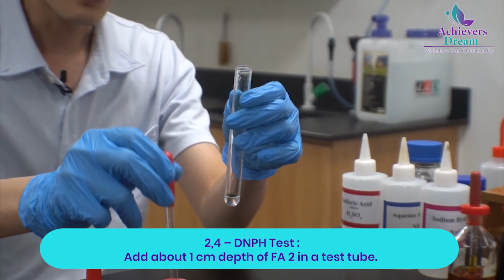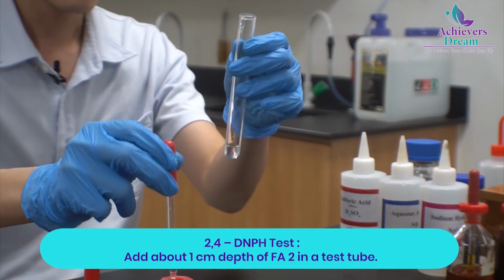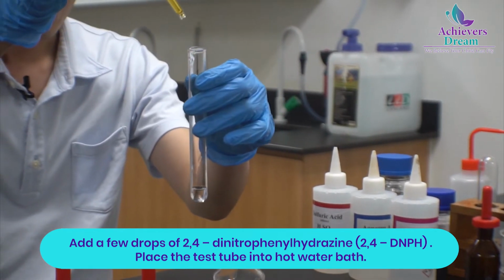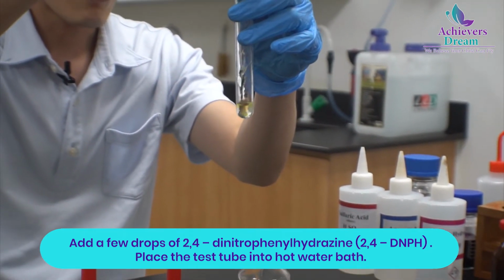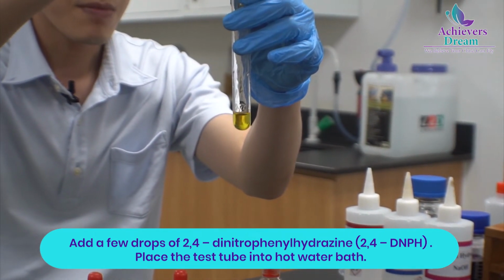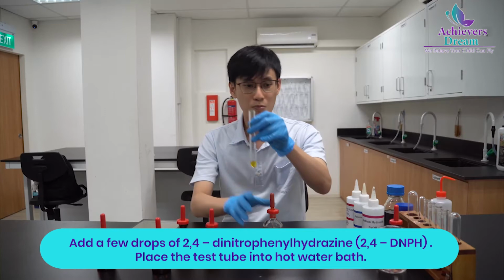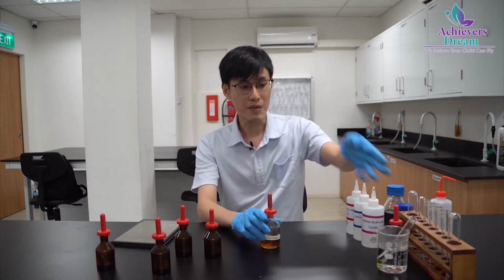So what I will do is add about 1 cm depth of FA2 first into a test tube, followed by adding some 2,4-DNPH. Just a few drops will do. We are looking for the presence of a precipitate, whether it forms. A few drops, and the solution is still clear. There's no precipitate. Just to play safe, I'll be warming it a little bit in my water bath right here.